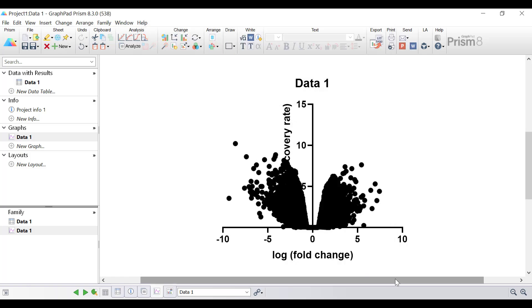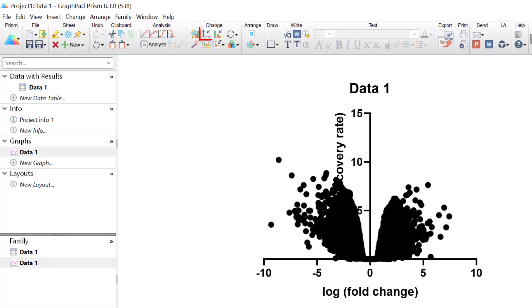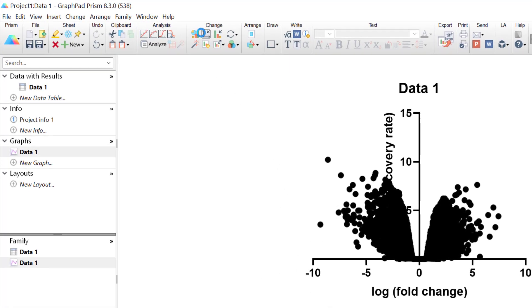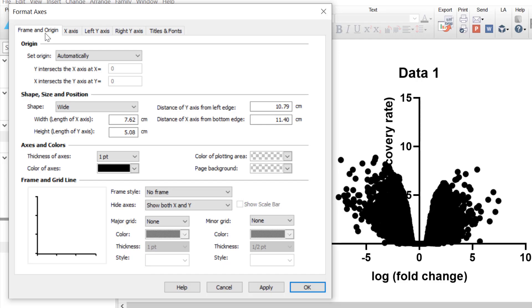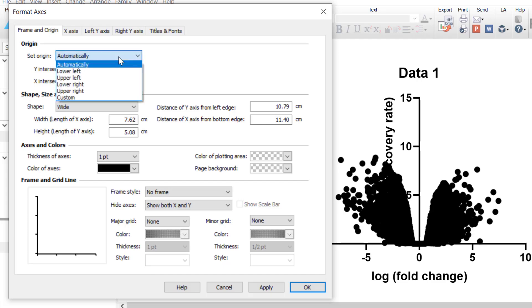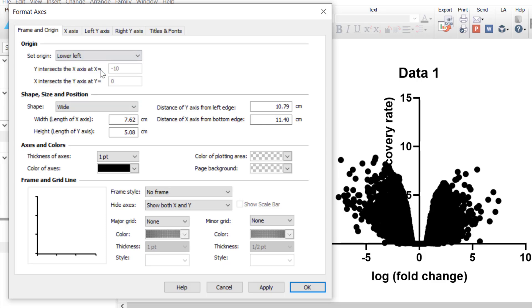The first thing I'm going to do is shift where the Y-axis begins. Currently the Y-axis is set at X equals zero, but this is being obscured because there are so many data points on the graph. So we want to shift the Y-axis to be in the lower left corner. To do this, I will click on the Format Axes button at the top, and under the Frame and Origin tab, where it says set origin, I'm going to change this from automatically to lower left, then click OK to return to the graph.